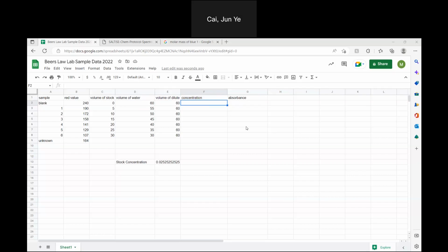Hello guys, this is a video for the Beer's Law sample data. You should have done the Beer's Law lab in class today. And right now I'm going to teach you guys how to construct a calibration curve.